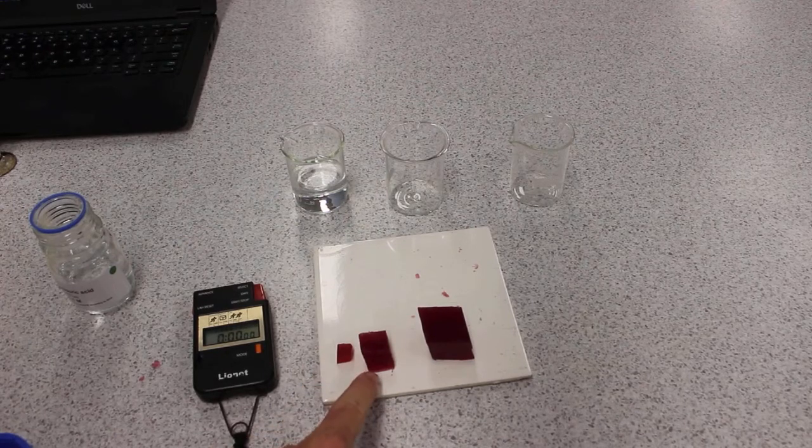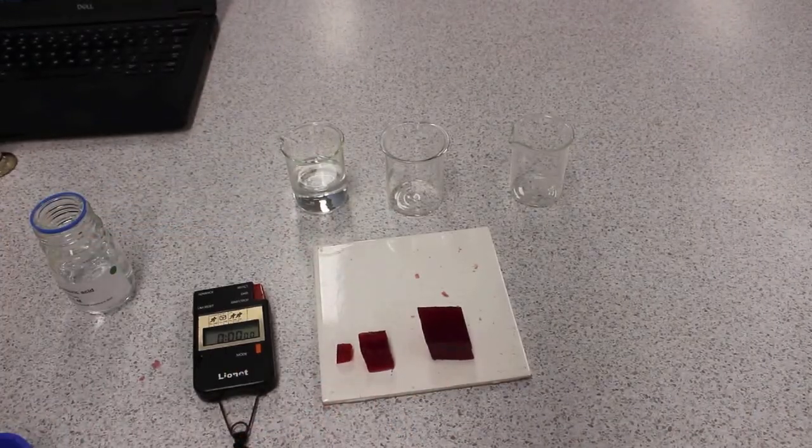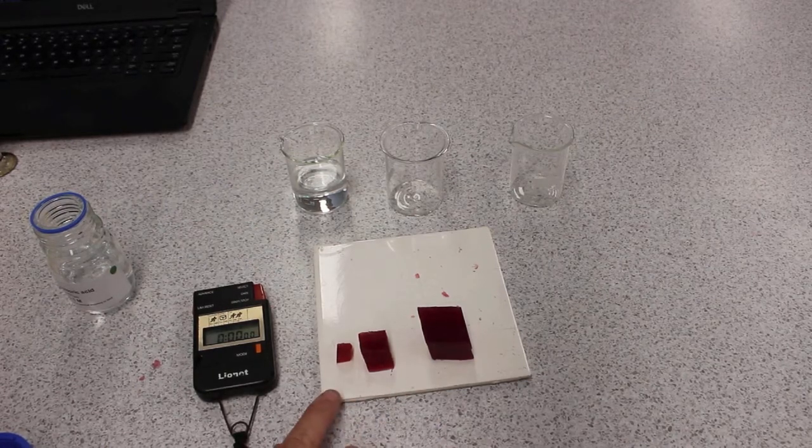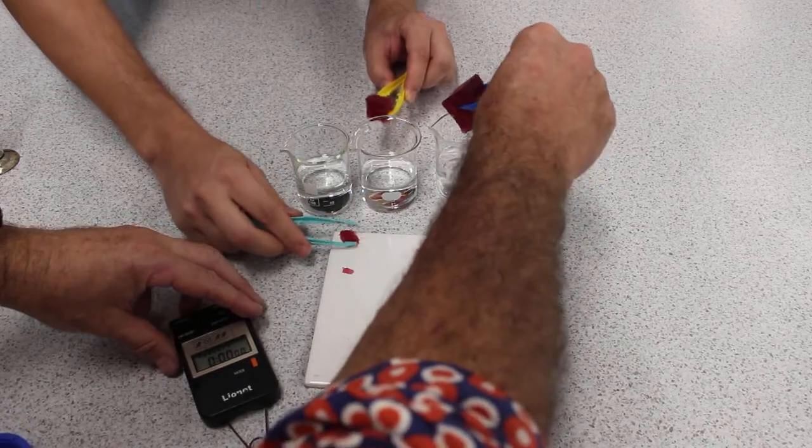We've got three cubes: 10 millimeters by 10 by 10, 20 by 20 by 20, and 30 by 30 by 30. We're going to submerge those in 0.1 mol hydrochloric acid and we're going to time it.